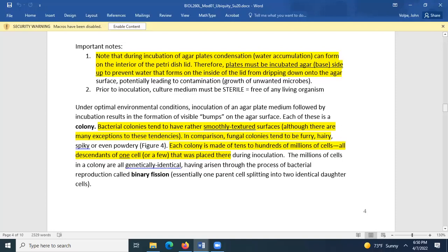Now, when moisture evaporates out of the agar, the moisture will start condensing on the agar. And then the agar will wick it all throughout the agar. So it actually will never form a drop and will never drop down. But even if it does drop down, it drops onto the lid and there's no bacteria or colonies growing on the lid.